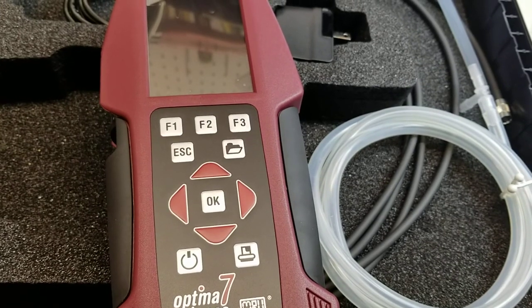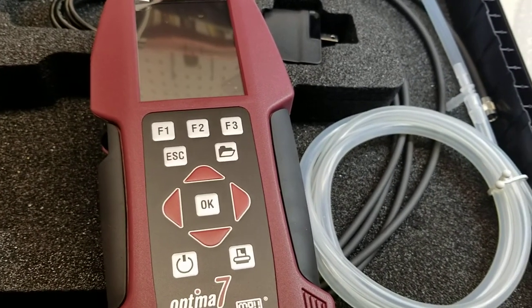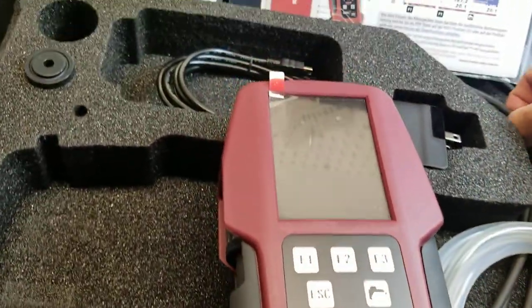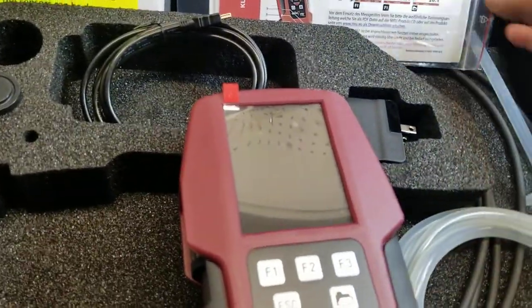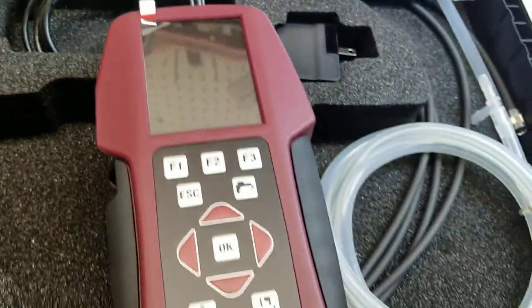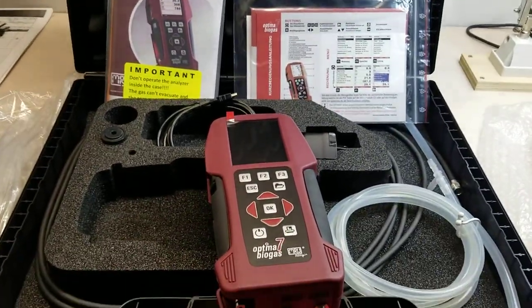We included the transport case and all of the hoses that you will need, and of course it comes with the charger. For the money and the price point, this is probably the best option you can get in this price range — under $4,200.